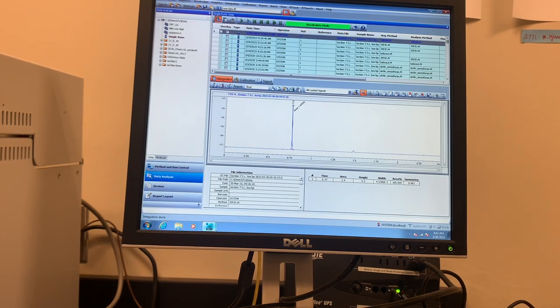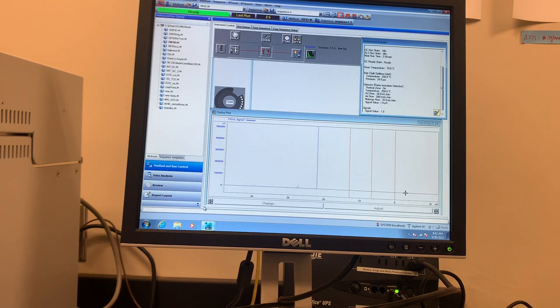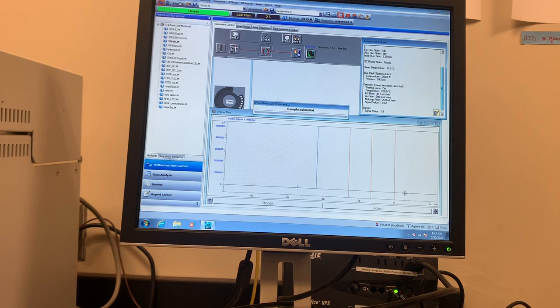Once your mixture contains less than 15% m-Xylene, obtain an IR spectrum of your product. Compare the stretches to those given in the experiment introduction to determine the substitution pattern of the benzene ring.